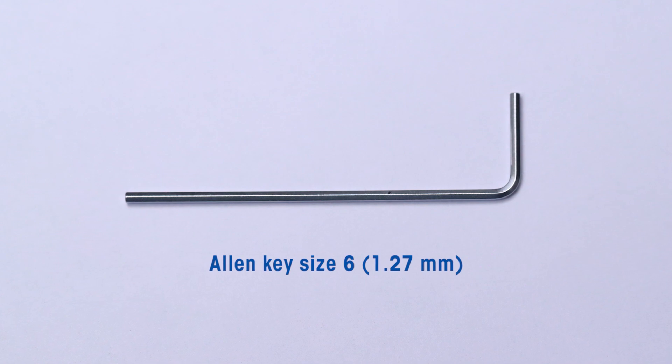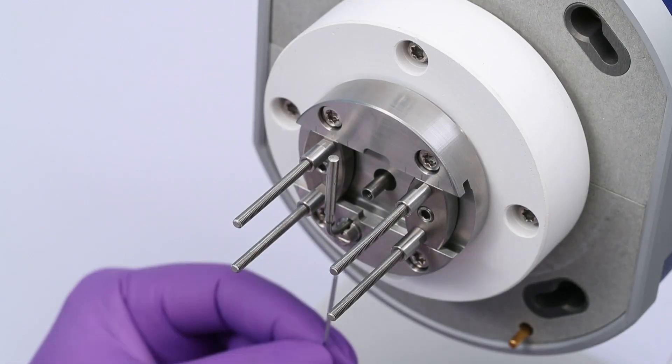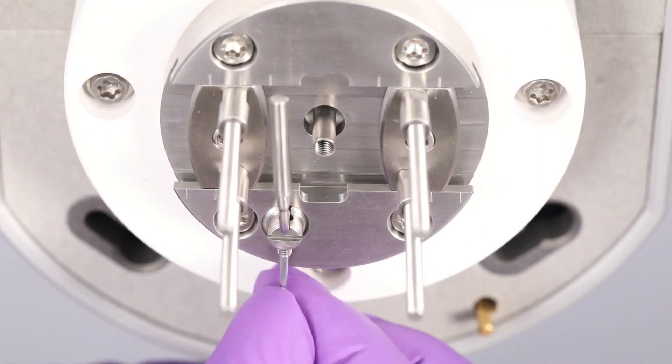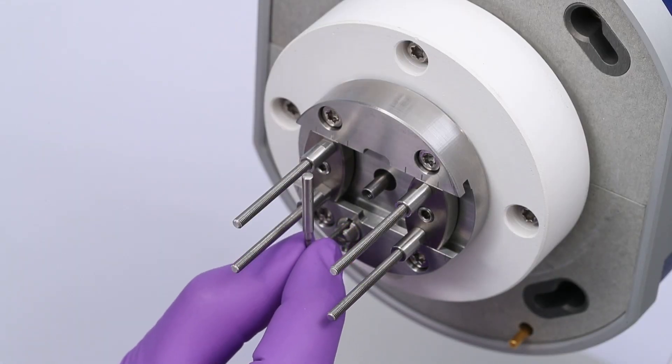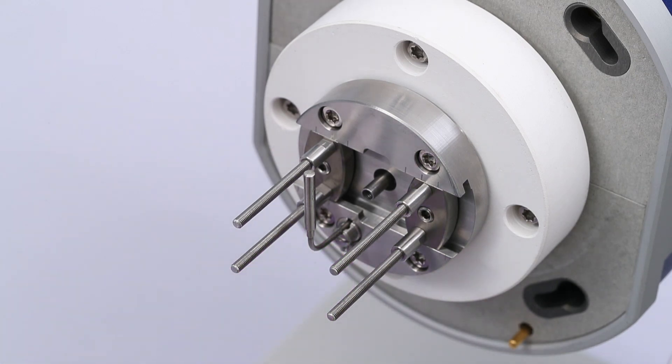Loosen the securing screw on the temperature sensor with a 1.27 mm allen key. Pull the temperature sensor sufficiently outwards to allow the fitting of the drive shaft onto the drive shaft part of the tension clamp.